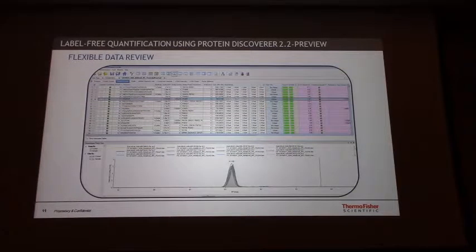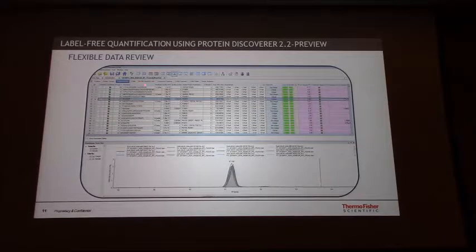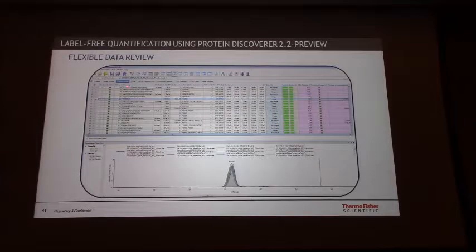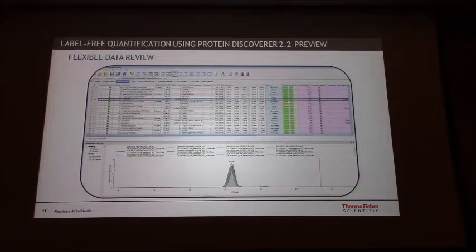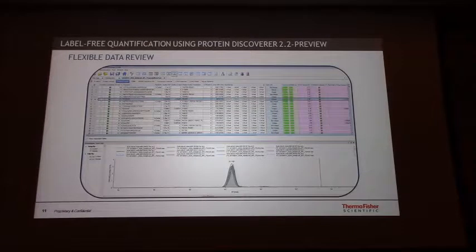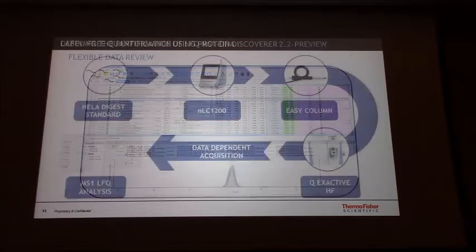Here is a screenshot of the software. You can see that you get different tabs — for example, in the peptide groups tab you get all the peptide IDs with the different parameters, and we have examples showing where each feature has been detected and identified. If you click on a peptide, you can see how well the alignment has been done.